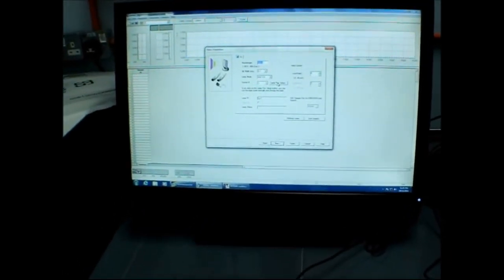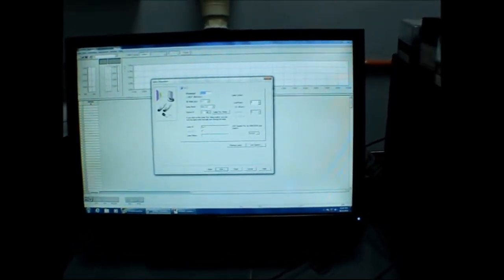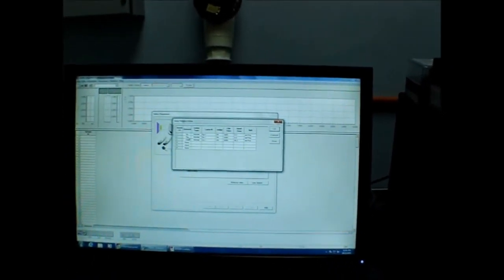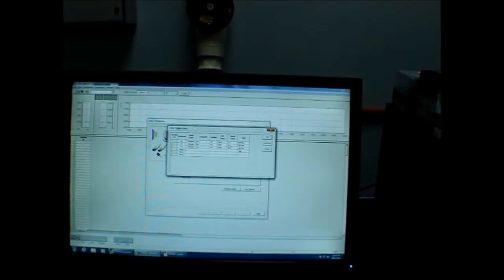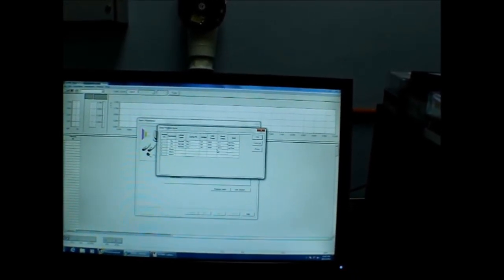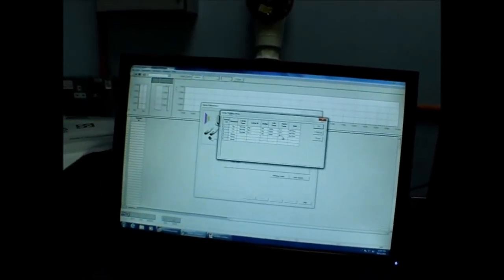Before that you need to set your lamp position. Do you still remember the lamp position? I had to write it down, right? Then you just key in here. First, mercury, selenium, copper. Copper is 3. Already used 40.3 hours. The lifetime is milliampere times hour. Milliampere depends on the milliampere you set, 6 or 10. 10 times 1 hour is already 10, so it's quite fast.